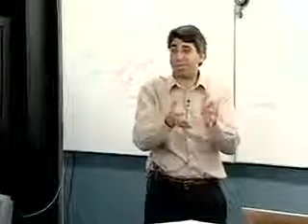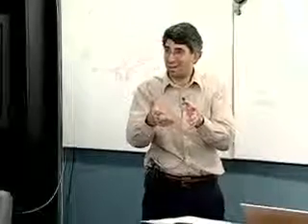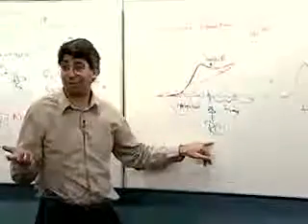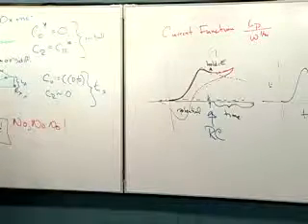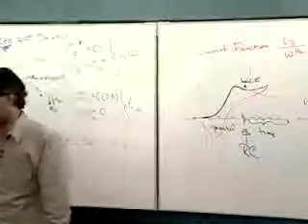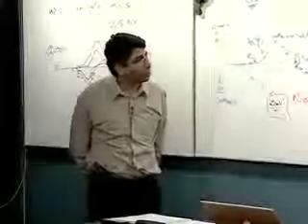And so there's a system that has a low number of redox active species on the one hand and is highly resistive. So you are going to have a big baseline there, and anybody that's done that knows that. You have a huge RC constant, and you just have to deal with it. You can't say, increase the supporting electrolyte, because the resistance comes from that alkane thiol layer. You simply have to know it's there, calculate it, and pull out your data from that. So sometimes the baseline issue simply goes with the problem.